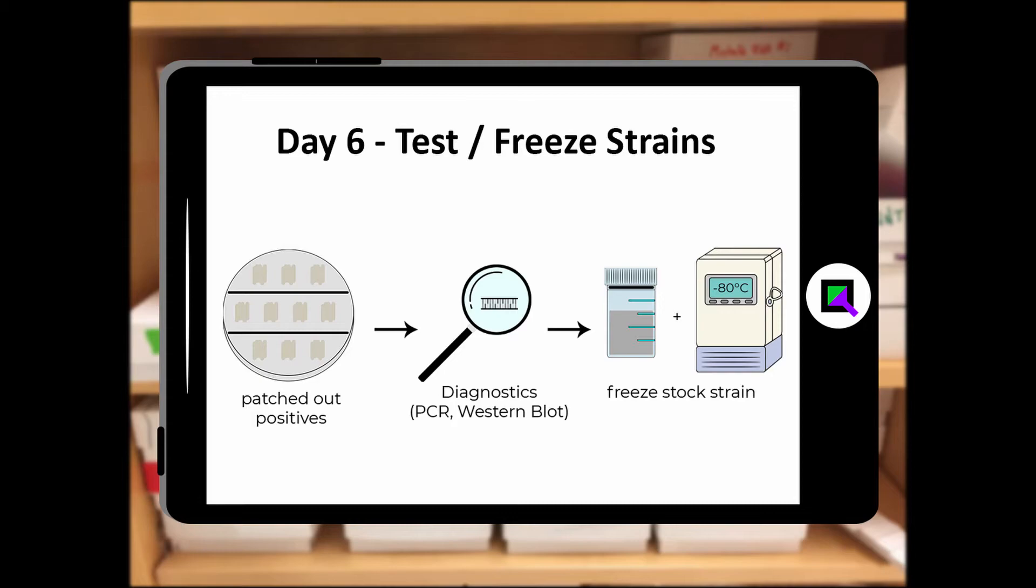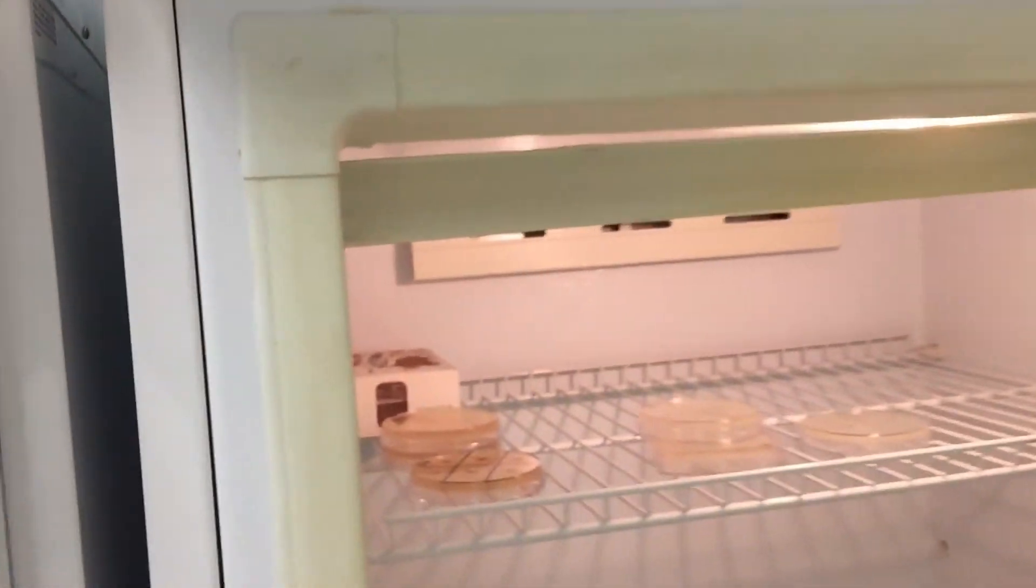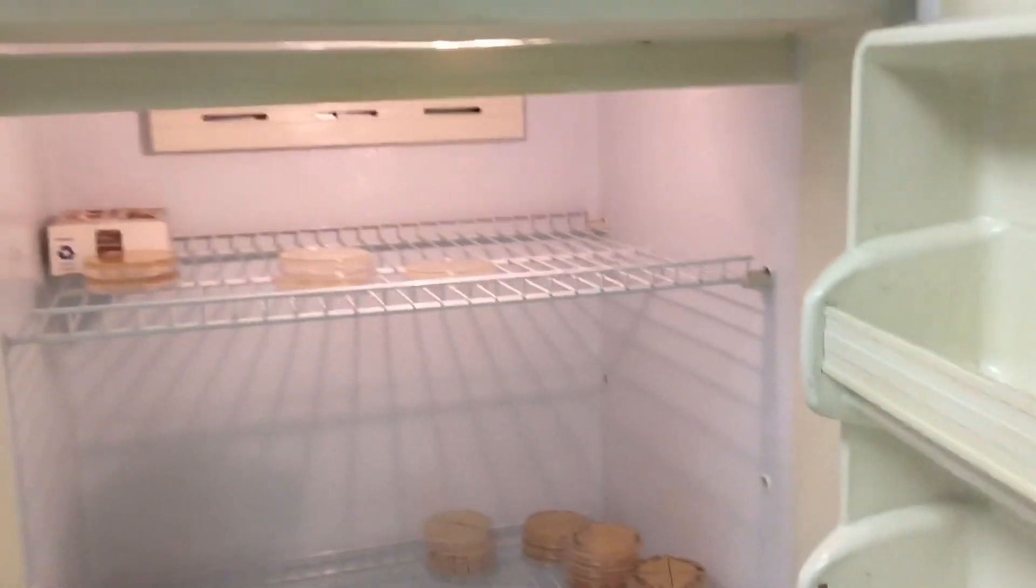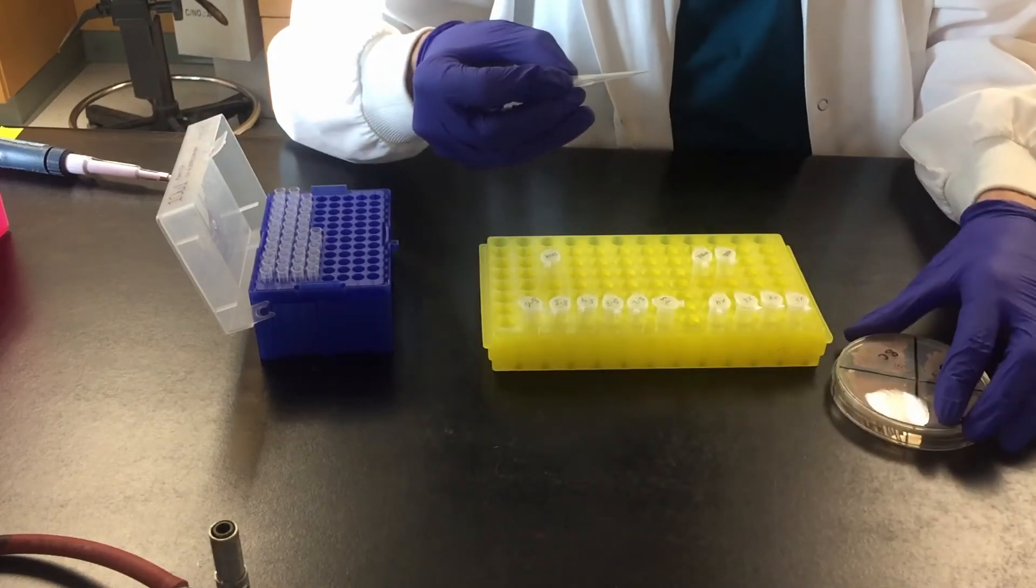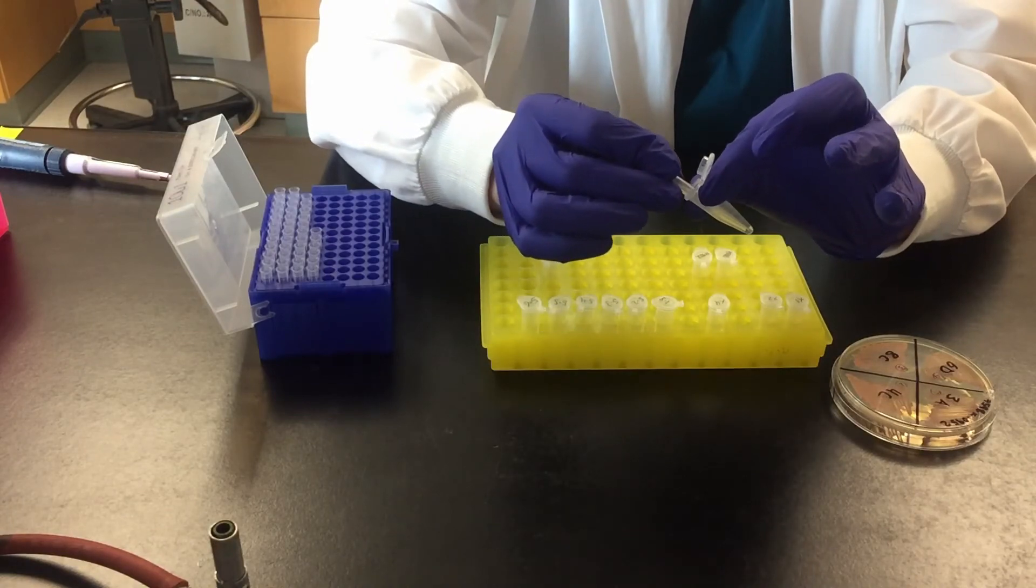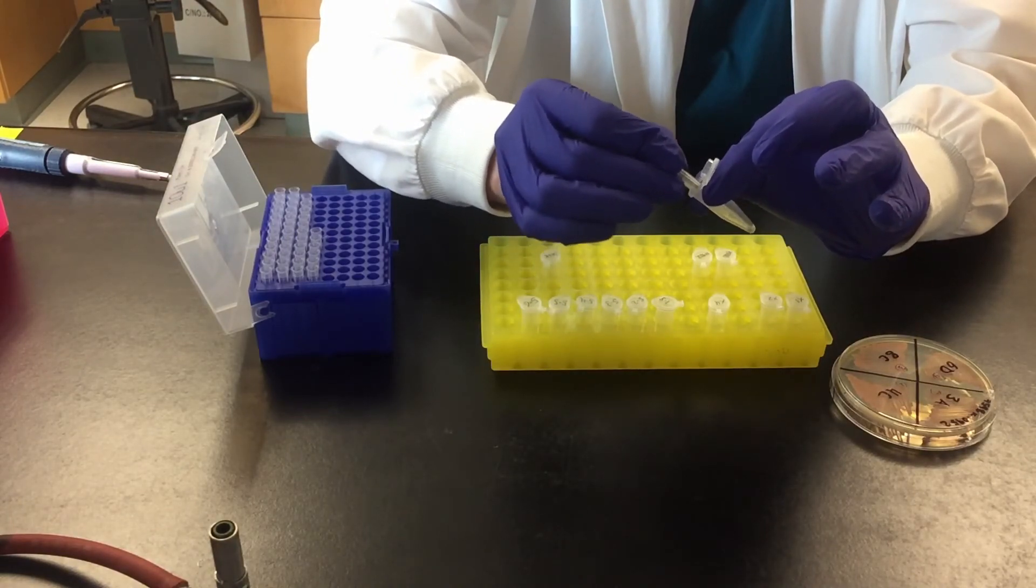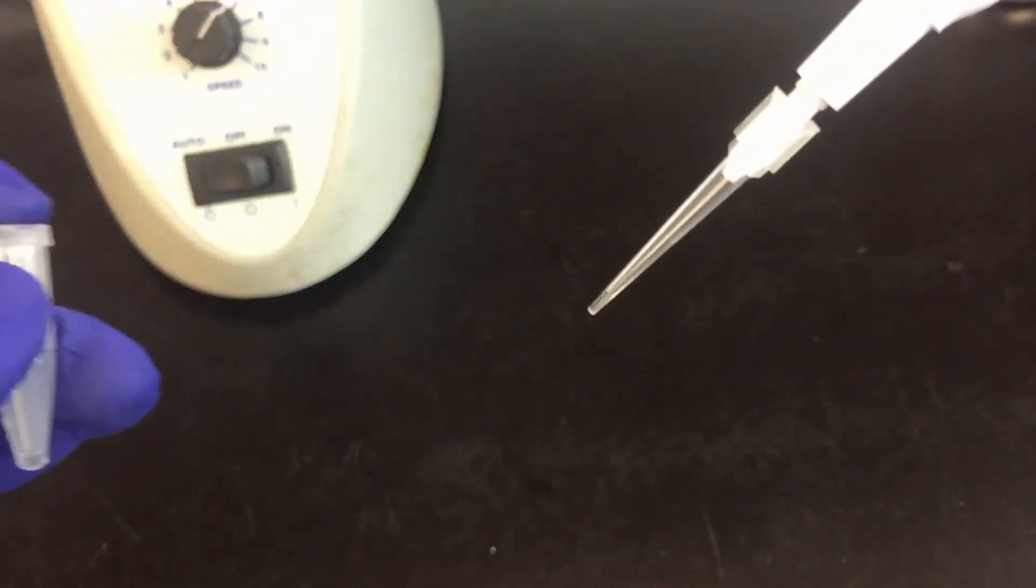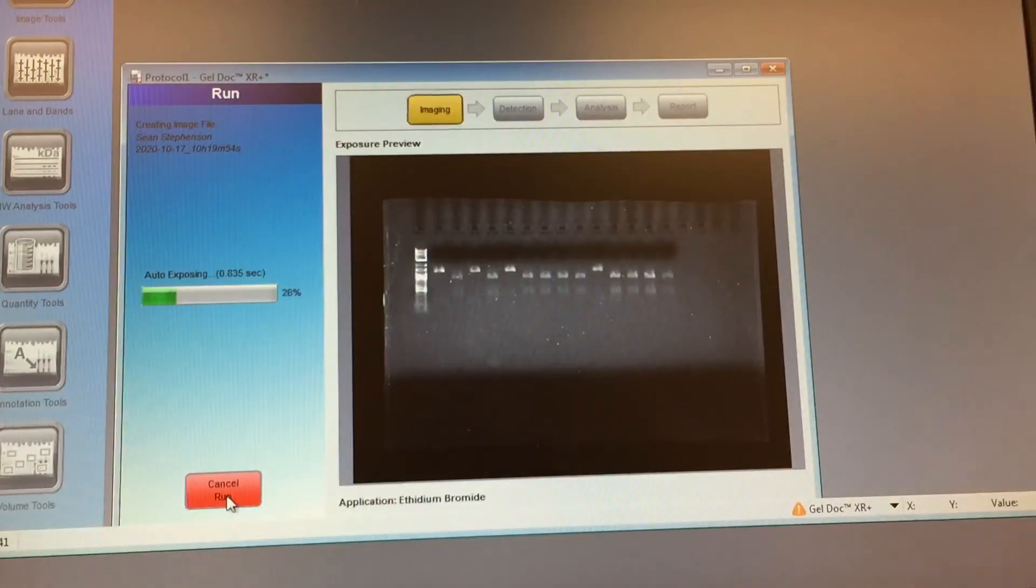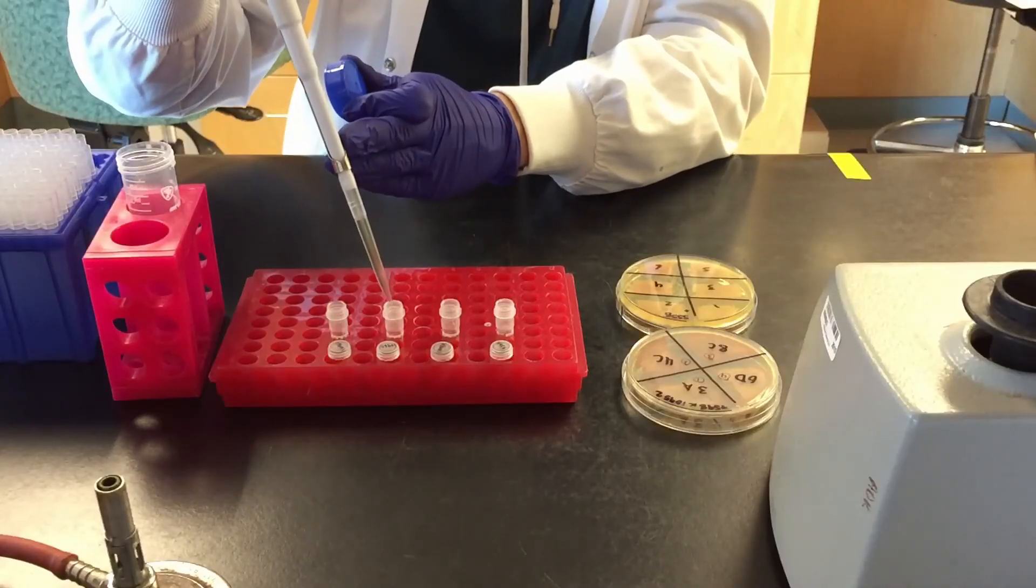Day six, freezing and testing the strains. After a day or two, the patches should be grown and ready to test. Any false positive colonies will not form a healthy patch. A small amount of cells go through the crude genomic prep. A tiny amount of DNA gets tested by PCR. After screening for confirmed positive strains, they are frozen.